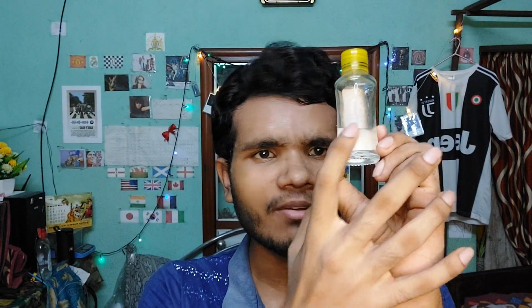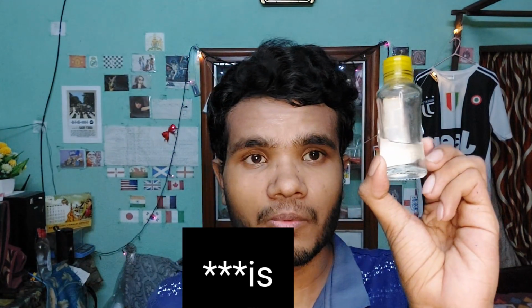So this reaction may be useful to identify compounds like acetone. One can identify if a product really has acetone or not. In the Indian market, this type of nail polish remover, I won't show the brand, is commonly sold, and the shopkeepers told us that it contains acetone, but it really doesn't. I have tested them with the iodoform test, and they always show a negative result. So they are fake products, and they scam people with missing information.